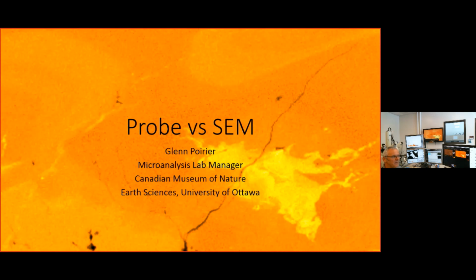But the state of software and the state of the instrumental analysis equipment have really, really improved over the past 10 to 15 years. And we can get some really interesting and nice data with a scanning electron microscope, which is available to a lot more people than a microprobe.